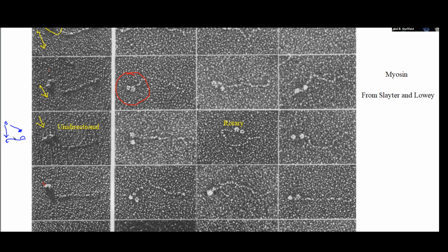Okay? What this is like is if you're looking for something that you've dropped on the floor and you can't find it with normal room lighting, if you take your phone light and bring it way down to the floor, you'll emphasize the shadows, of course, of all the dust, but maybe of the object that you care about. So you can do a low angle shadow and see a little bit more that way.